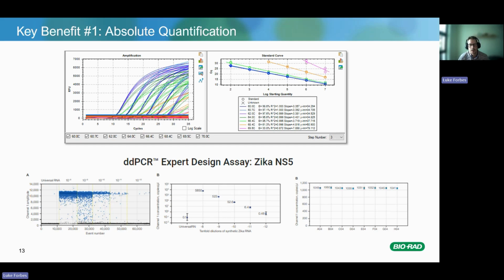However, when you look at RNA viruses, maybe things like Ebola and Zika, they have high variability, and they need to be detected in often very high backgrounds. So your DNA to RNA levels, you've got very low levels of RNA over DNA. So ddPCR is a really useful tool for viral detection, because it offers quite a lot of advantages over qPCR alone.